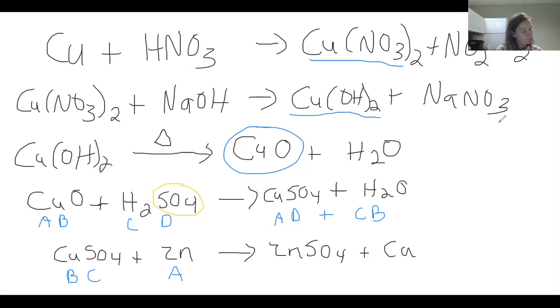What we're going to look at next is number 2 of the pre-lab 11 on page 61. It gives us the initial mass of copper. So this initial copper that we started with at the very beginning of this series is 2.0465 grams. And they want to know at the very end of the experiment, notice we're ending again with just solid copper, copper by itself. So we're going to be comparing the mass of the copper we get at the very end of the experiment to the copper that we started with. We're going to compare it by doing a percent recovery calculation and a percent error calculation.